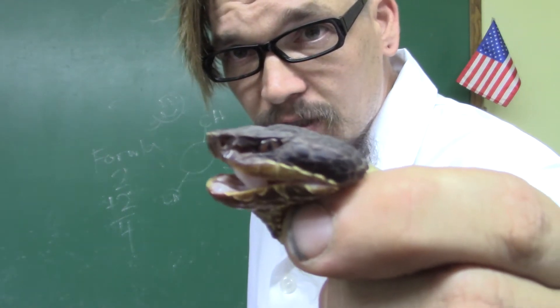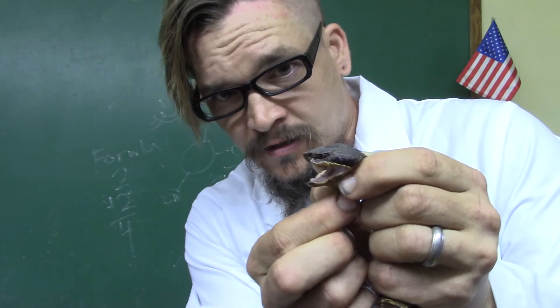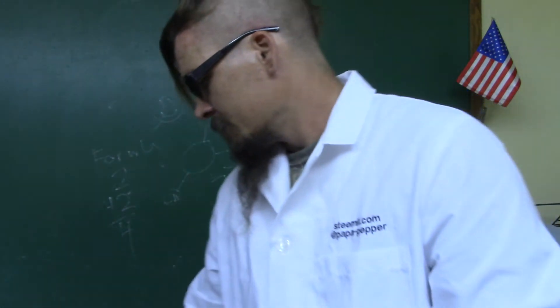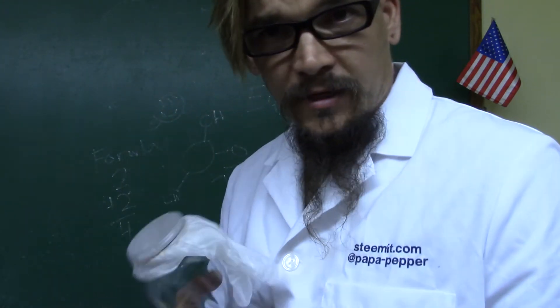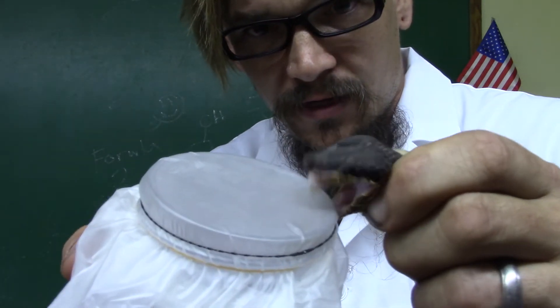So this happens to be a water moccasin. It's a venomous snake. And we're going to try to see if we can milk it. I've already prepared one ahead of time, like they do on the cooking shows. Stretch that over the top of there, and we're going to try to see if we can get it to bite.